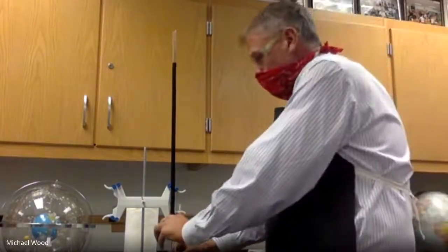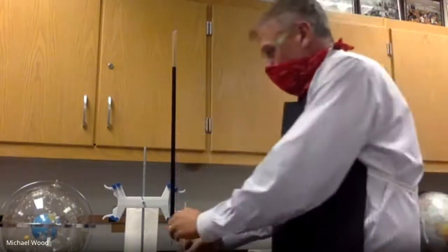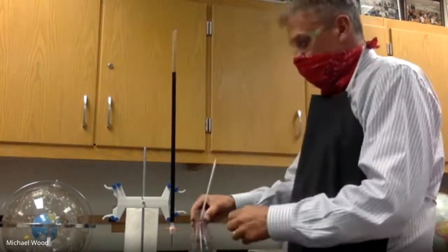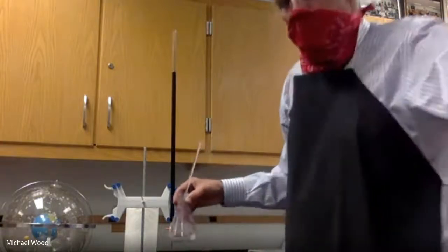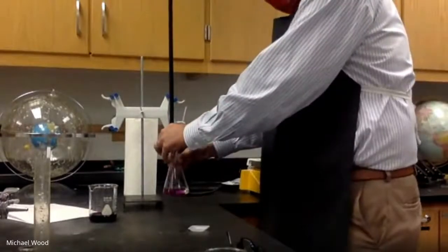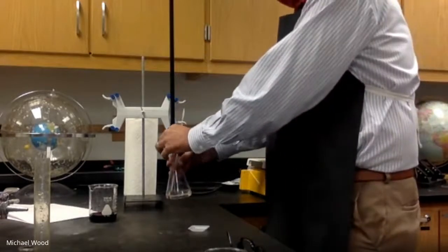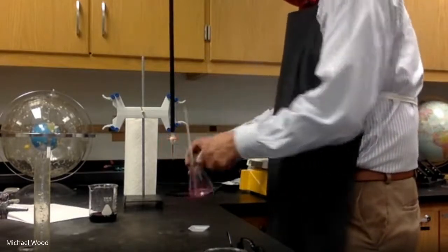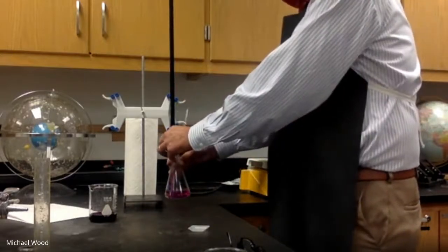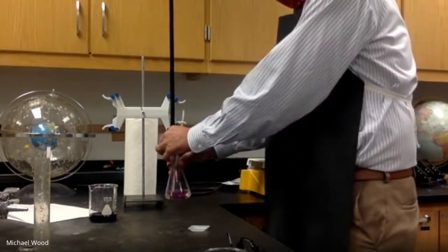Okay, so I'm just going to add, and this is why it was unfortunate that last spring we did not get to this, so you guys can see this. So I add this, and what the classmates are seeing is the color, but I want it to go until it remains. What's going on here is it's being neutralized, or a reaction's going on, and I want it to go until I get to a faint pink color.